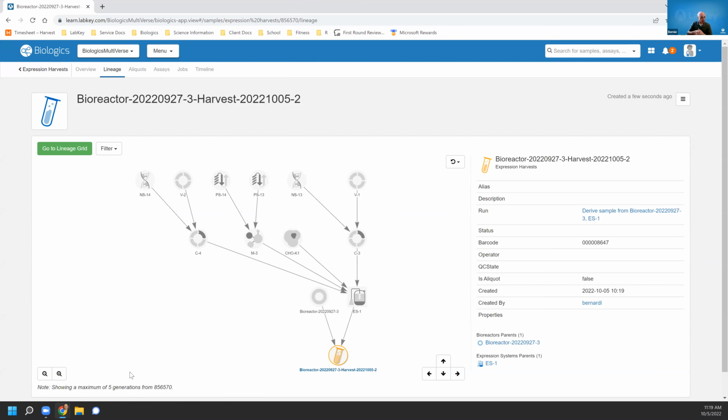We hear stories all the time of people going from massive multi-tab spreadsheets where you do have to maintain that information on every sheet, in every file for every sample of every type, and that of course takes up a lot of space and can be potentially error prone. Here, as long as you connect it to one thing in the system, it's connected to the rest. So this is actually a pretty decent way of giving you an introduction to our bioregistry.